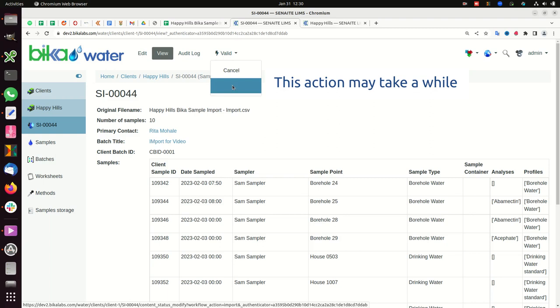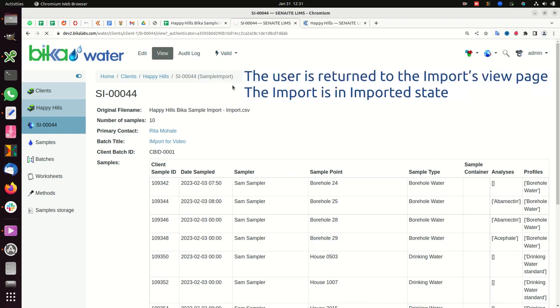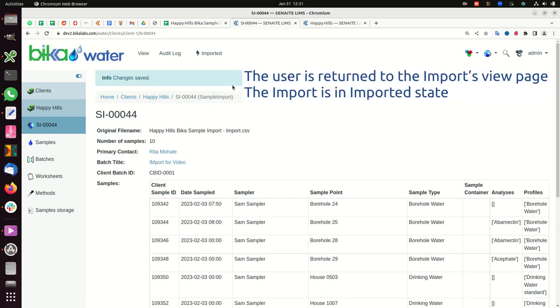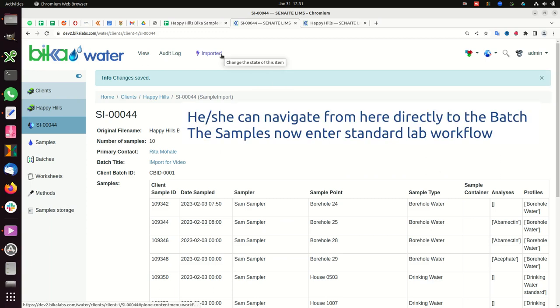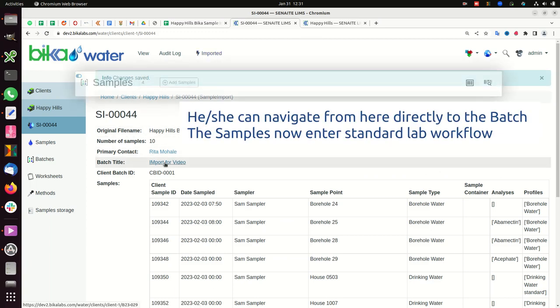This action may take a while. The user is returned to the imports view page. The import is in imported state. They can navigate from here directly to the batch.